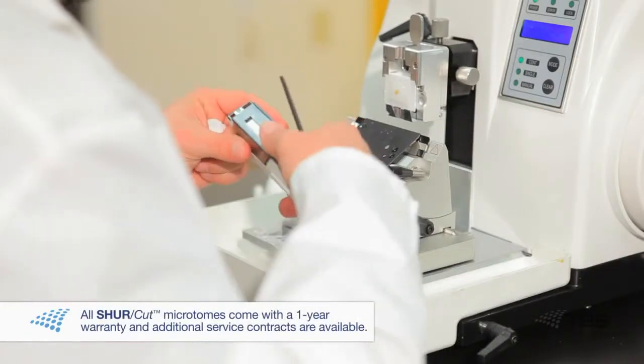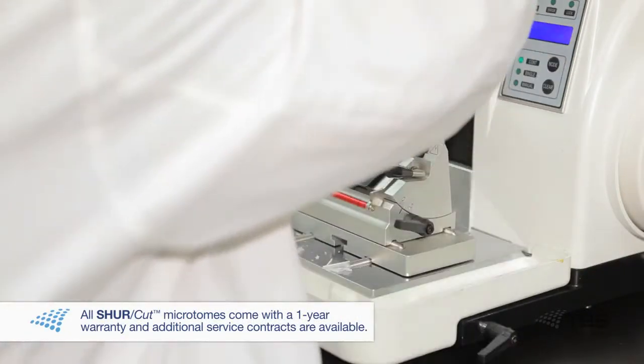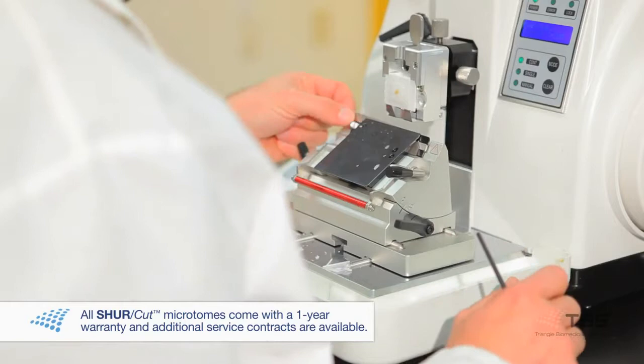The TBS SureCut Microtome has a universal blade holder. This allows each histologist to use a high or low-profile disposable microtome blade, depending on their preference.